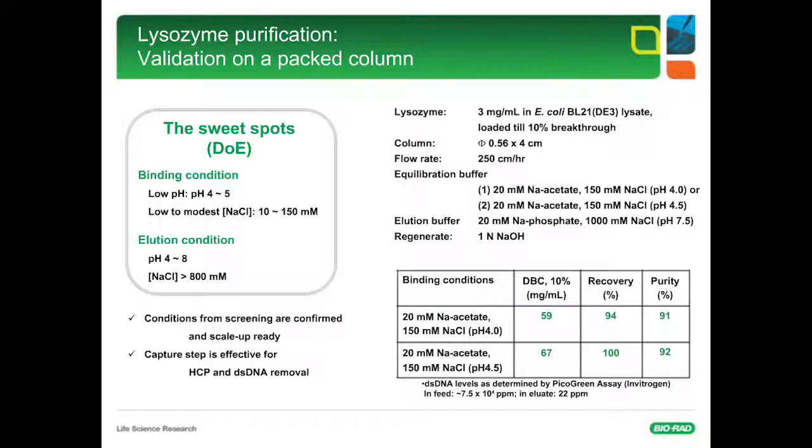And then for elution, it seems that elution of lysozyme is not sensitive to buffer pH. Pretty much from 4 to 8, you can achieve elution as long as the salt concentration is higher than 800 millimolar.